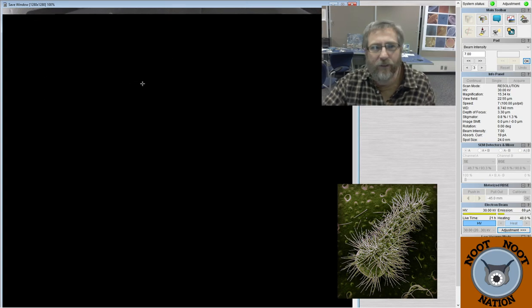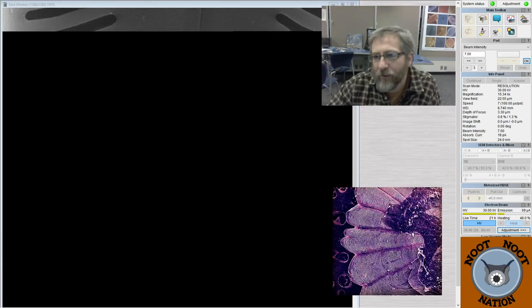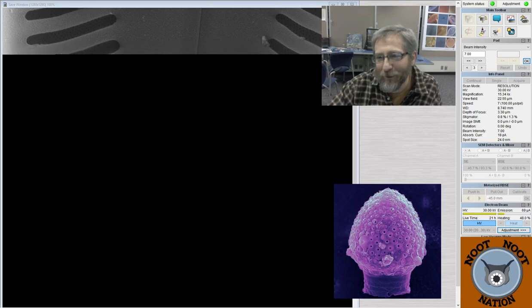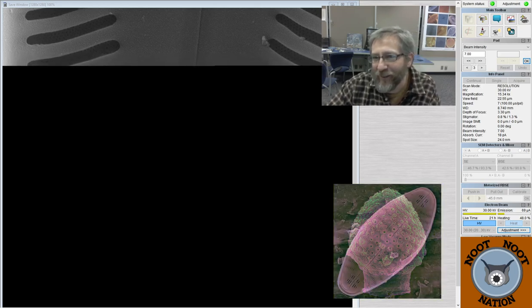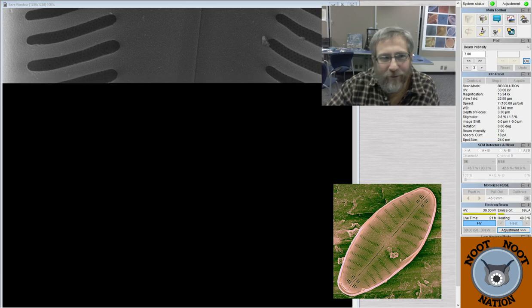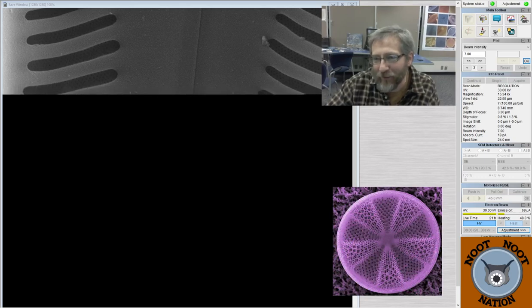And then this will be our last picture. And now's a good time for me to say thank you for hanging out. Barely visible is what SEM is for. I know. Let's see. But look, you can see these little tiny pores, and you can't see those in the light microscope.